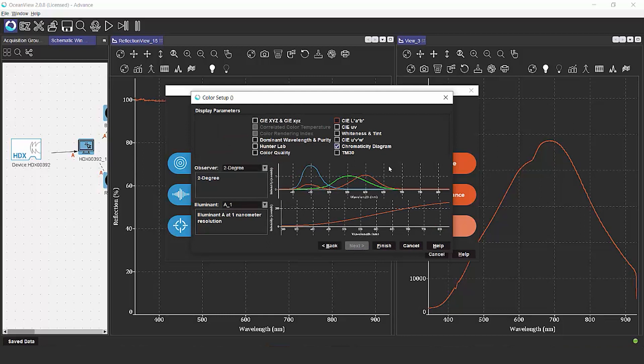We have the option, as you can see here, of choosing from several different quantitative color values that we can output in the software, as well as picking our observer and illuminant. Then we're going to click finish.